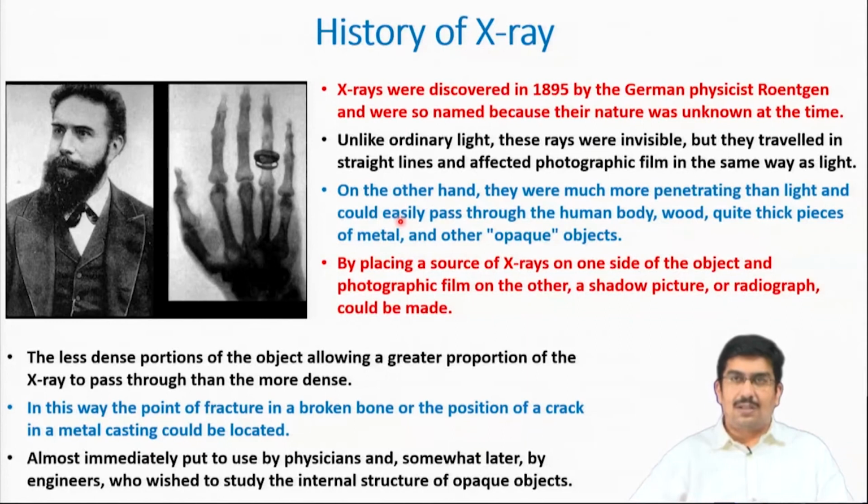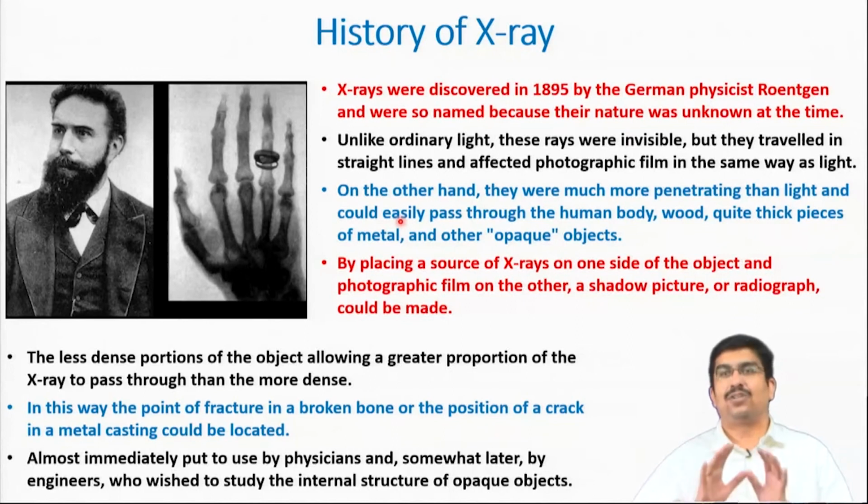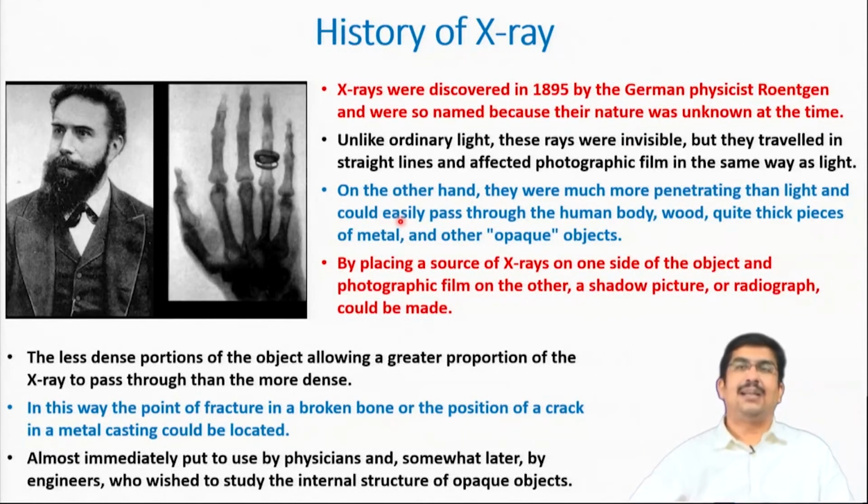Okay. So, with that we close our discussion about SEM, and now we are moving towards the X-ray part. The first thing about X-ray: if we compare X-ray and electron microscopy, because we have studied electron microscopy and kept on telling that it is a very popular one because of its diversity, the different kinds of signals it can give, the different modes you can use. You can get imaging, you can get diffraction, you can get compositional analysis.